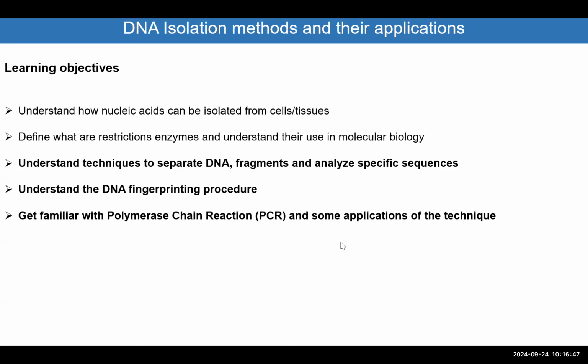And finally, I will introduce you to the polymerase chain reaction. I know most probably you have already studied polymerase chain reaction, or PCR. Some of you might not, because I know some of the students in the class have never done molecular biology or cell biology in depth. So we have to go slowly on this. Plus, I will show you how to set up the reaction for a PCR. In other words, what material you need and how you design the primers and all the steps.